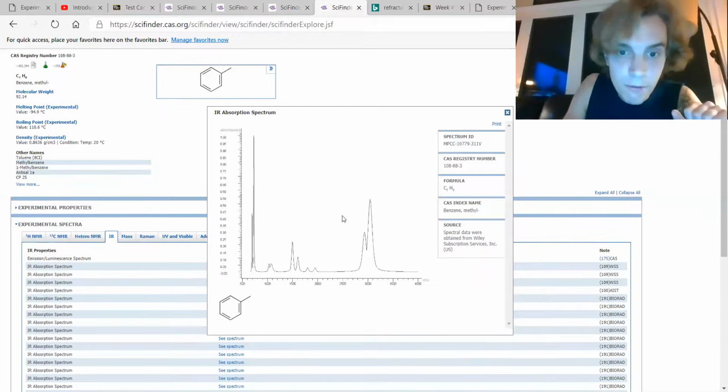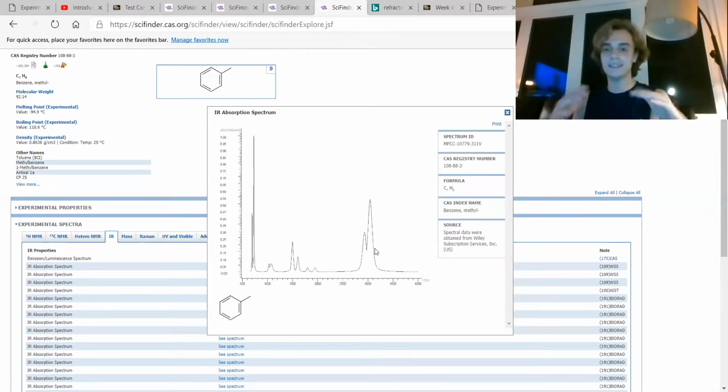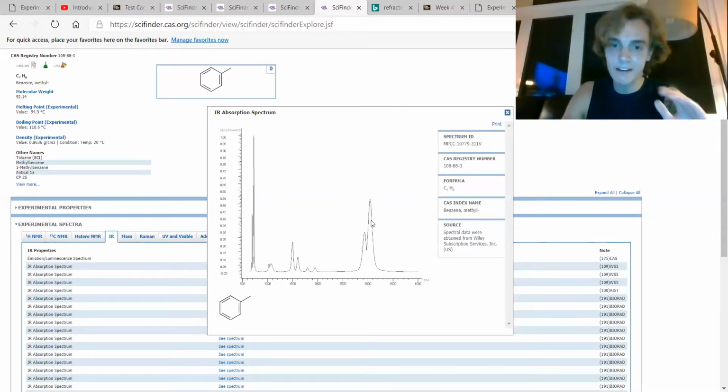Now if we move even further along, we see this toluene. The big difference between toluene, your 2-methylpentane, and your cyclohexane, your N-hexane, is that you now have an aromatic compound. So you now have a compound that follows Huckel's rule, the 4n plus 2 rule. So that is a very quick and easy and dirty way to identify toluene.